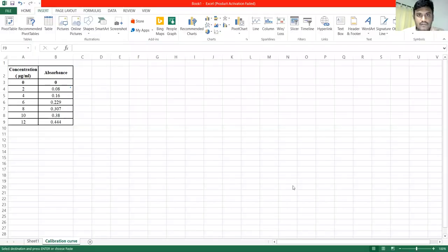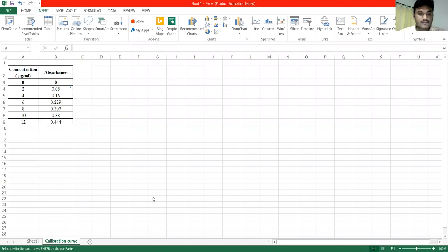Hi everyone! Today, we have been able to calibrate the LR draw in the Excel sheet. Now, we will open the Excel sheet and create the Excel sheet.